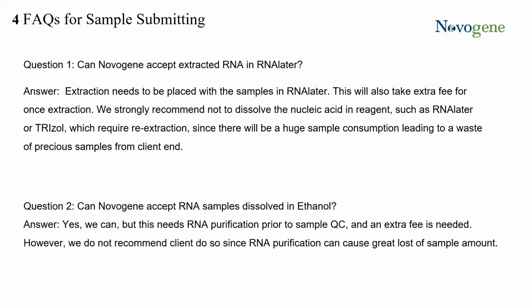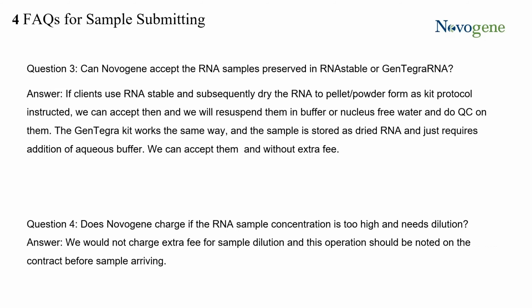Can we accept RNA samples dissolved in ethanol? Yes, we can accept it. Again, we need to do purification prior to sample QC, which causes an extra charge for purification and also a great loss of your sample amount. Can we accept RNA samples preserved in RNAstable or GenTegra RNA? Yes, we can do that. We resuspend them in buffer or nuclease-free water, and then do the quality check before going to the downstream process. So we can accept them without any extra fee.